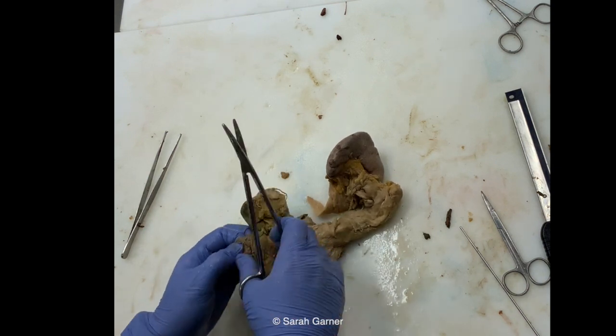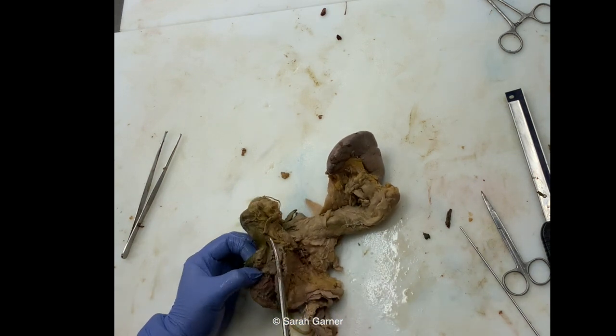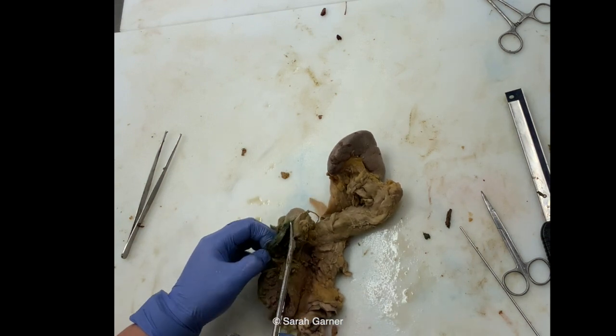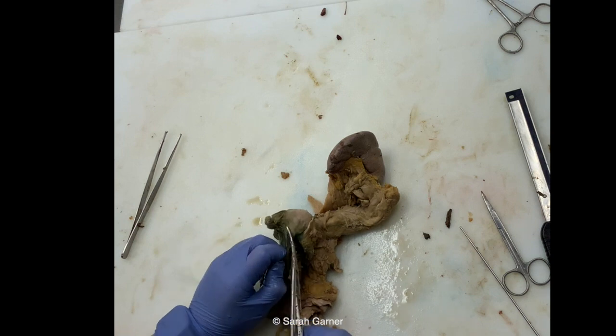Ideally, then you'd be able to find your ampulla of Vater, also called the major duodenal papilla, and then probe that and then cut along that just like you would for a Whipple. Now, of course, there's a couple different ways to gross a Whipple, and a lot of that is going to depend on the pathology present, but that is one way that you can gross a Whipple.